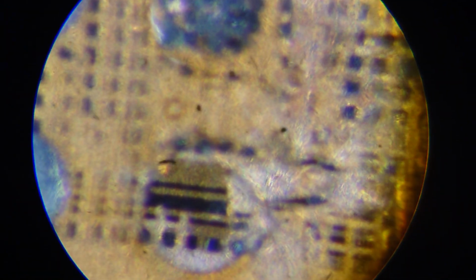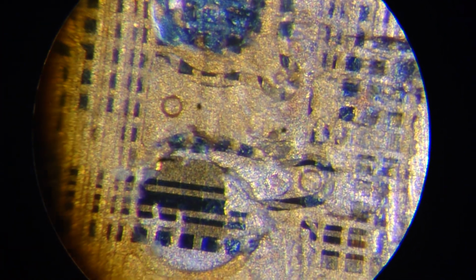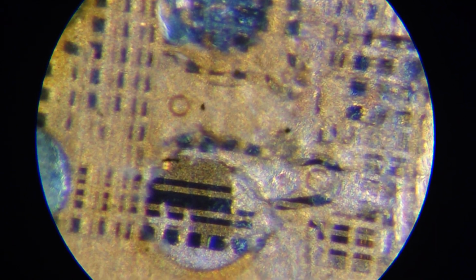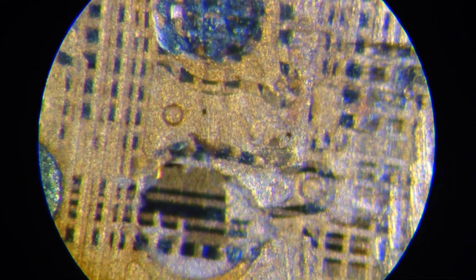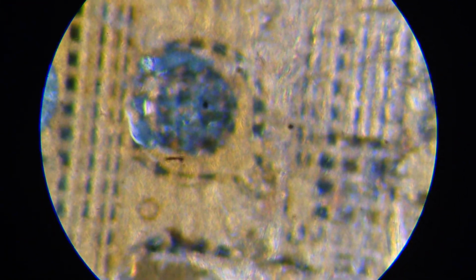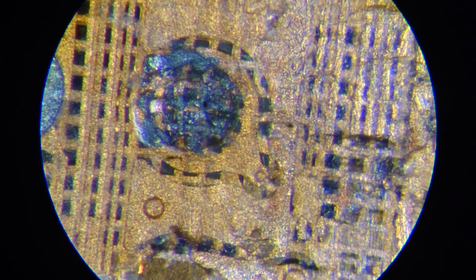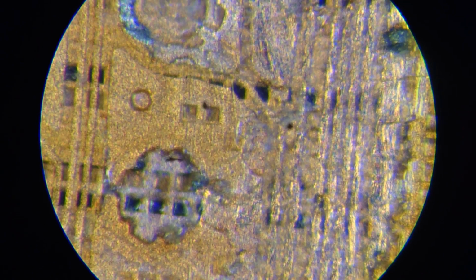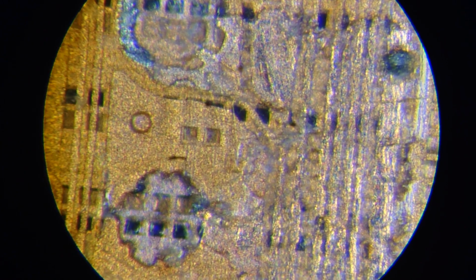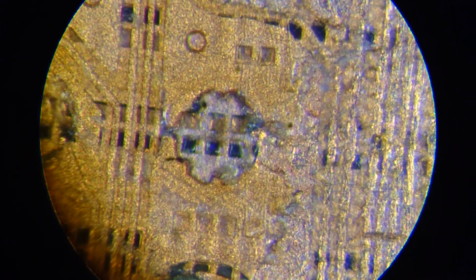So in our case, we can distinctively see different layers, not only by 3D viewing, but also by just losing the focus over there. Okay, so let's walk over the processor now a bit to see parts I guess you already have noticed with different previously tested objectives. So we're just slowly moving over the processor, and I will change focus a bit to upper layers and to lower layers. So let's just move.